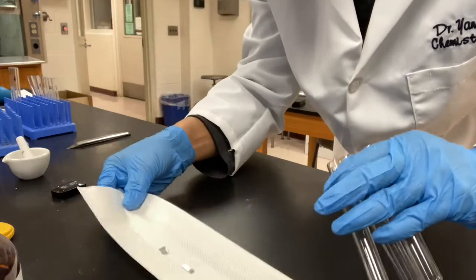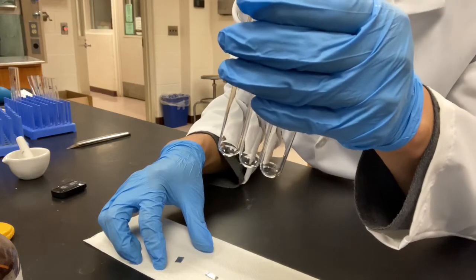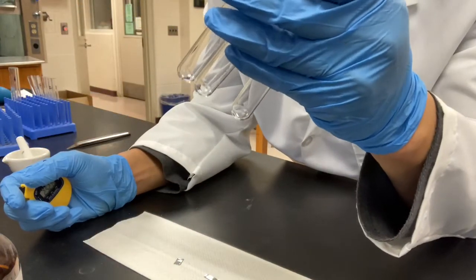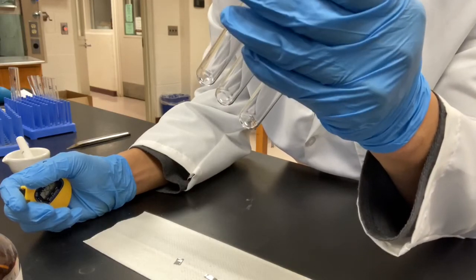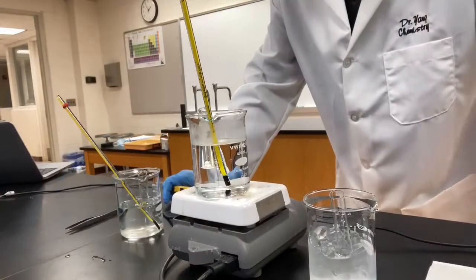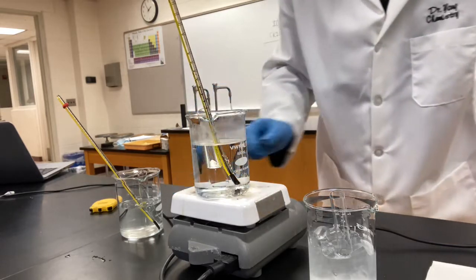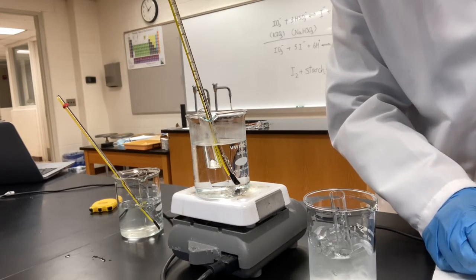1 piece of zinc strip to each one of them. I actually measured the mass of them. They're the same, all around 130 milligrams. Once we put them in, we're gonna start a stopwatch. We are going to take a record of the time it takes for each reaction and compare the 3 reaction times to see which one goes faster. All right, let's start with the temperature. The reaction at the highest temperature, the one at 50 degrees Celsius, we expect it will react the fastest.